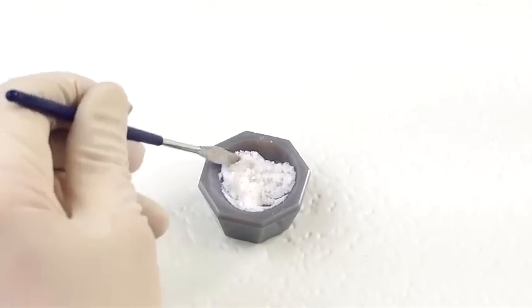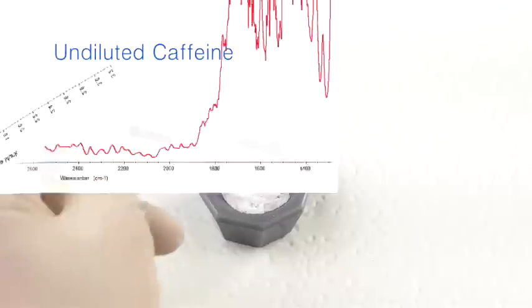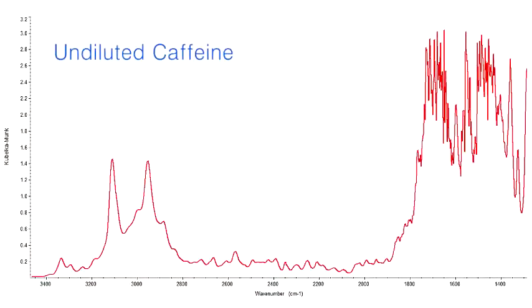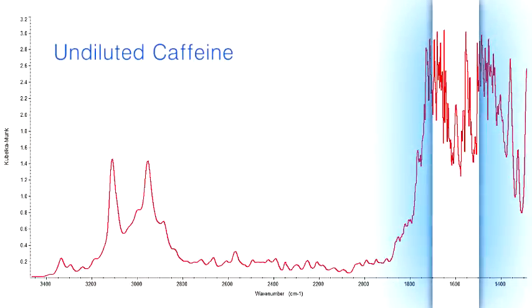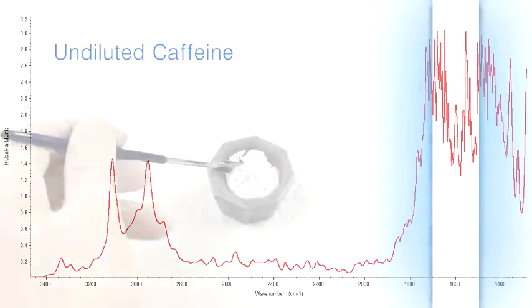Let's look at an undiluted spectrum of caffeine collected by diffuse reflectance. Poor spectral quality is observed, especially in the fingerprint region between 1700 to 1500 wavenumber.